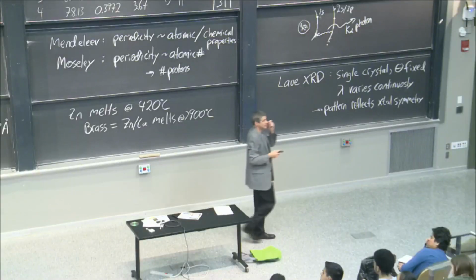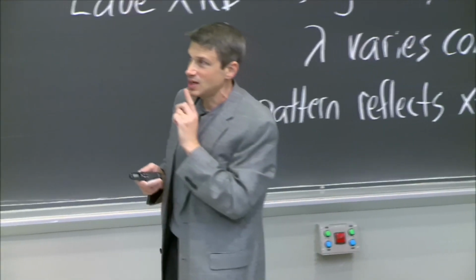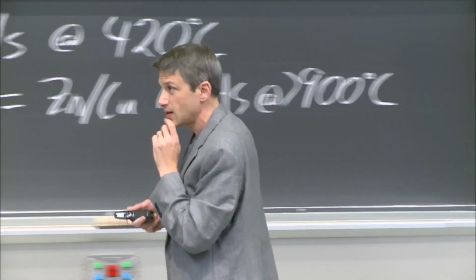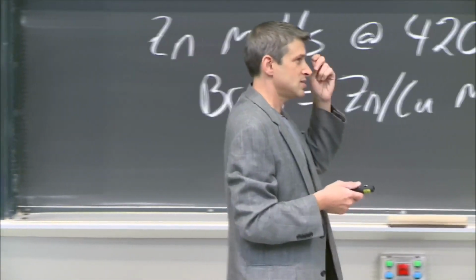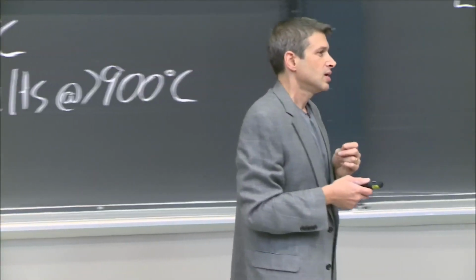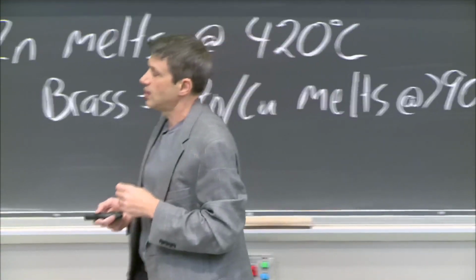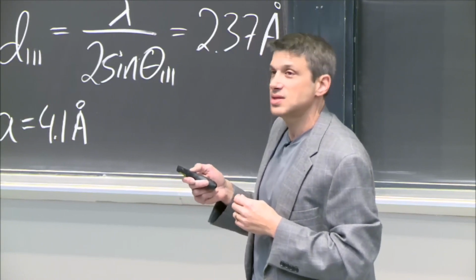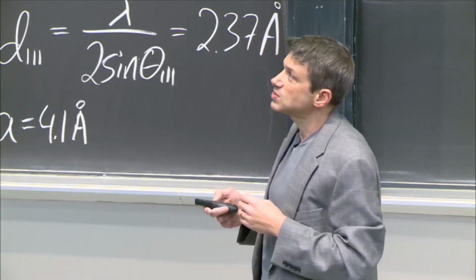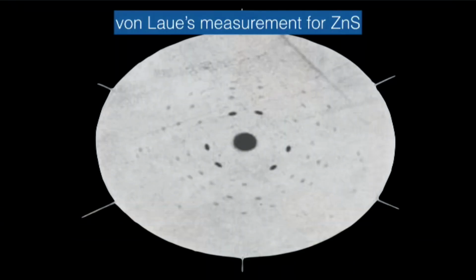In those spots, it's more complicated to get the crystal structure. You can get symmetry fairly easily, but getting the structure itself is a little bit more complicated and can be tricky. For that and other reasons, most work today is done with characteristic peaks, XRD. But this happened before, and so I wanted to show it to you. In one of Laue's very famous papers, this resolved the structure of zinc sulfide. It was very important work. And those are the spots.